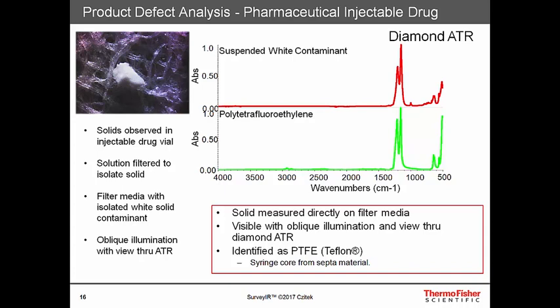Another pharmaceutical example involved suspended particles in an injectable pharmaceutical. On the upper left, we observe one of these particles on filter paper from which the particles were filtered — a white particle on the surface of a cellulose-based filter paper, imaged with oblique illumination through the diamond ATR crystal. The spectrum of the contaminant shown in red in the upper right correlates very well to polytetrafluoroethylene, also known as Teflon. The SEPTA material in the injectable drug was composed of Teflon, and it's believed some of the SEPTA material contaminated the injectable pharmaceutical.